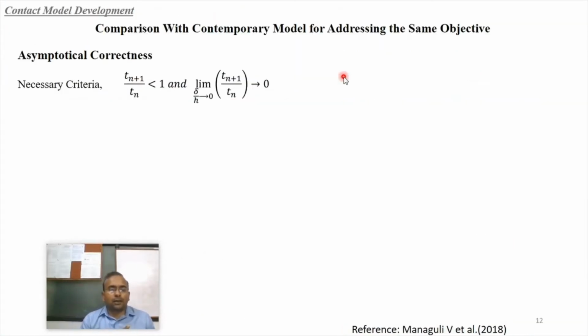It's not that this is the first time somebody has developed a contact model that accounts for the bottom substrate effect. There are many attempts. In 2002, Dimitriadis developed a contact model for a colloidal probe, which takes into account the thickness of the sample. In 2009, there is Santos, who developed an empirical equation using simulations.